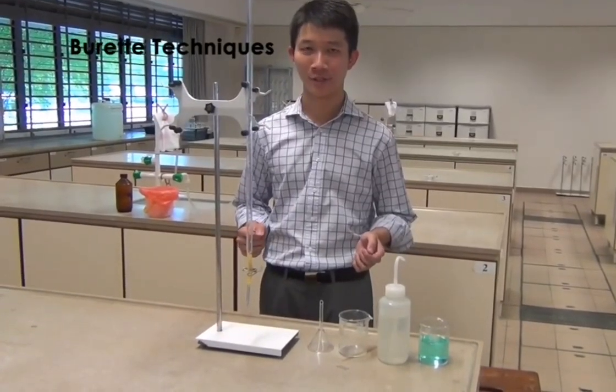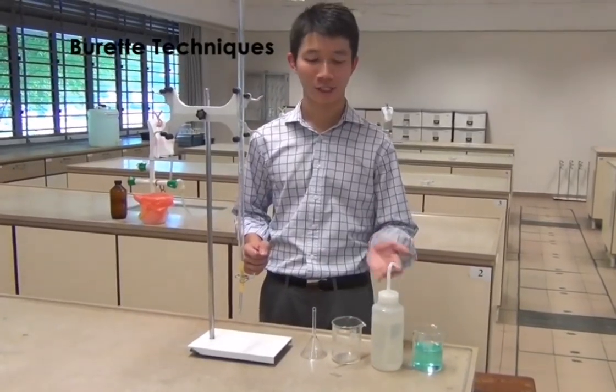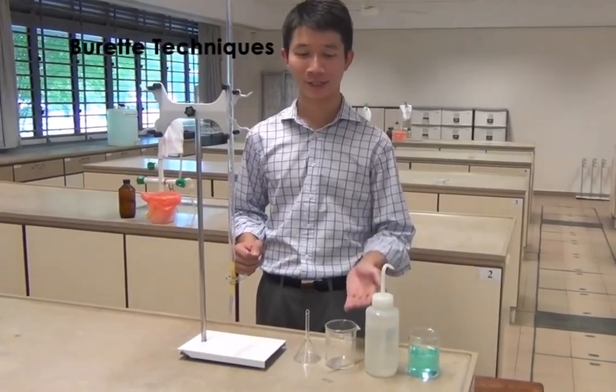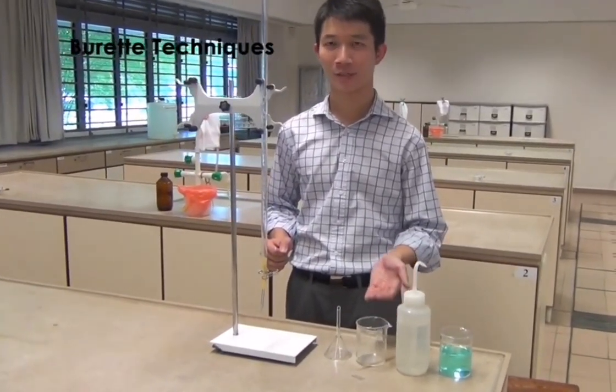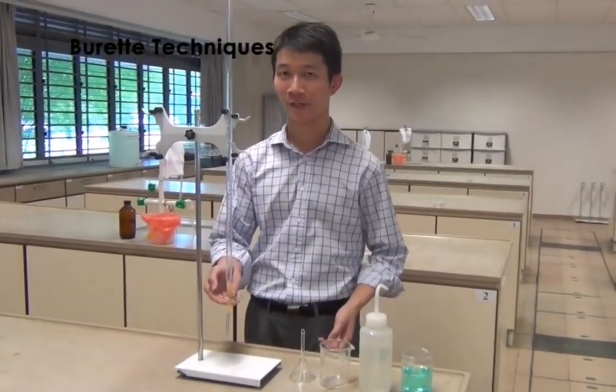What are the apparatus that you need? You need the solution that you will be filling the burette with, deionized water, a glass beaker as the waste beaker, a glass funnel, a burette, and the burette clip.